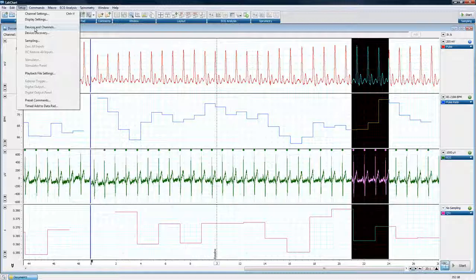They had 2 PowerLabs running, so they had 32 channels, all of them with something connected. On certain days, they would record from all of those channels. But on some days, they may only want to record from channels 1 through 3 on the first PowerLab, and then, say, 5 through 8 on the second PowerLab. Only those specific channels. So what we did is we created settings files that allowed them to do that.